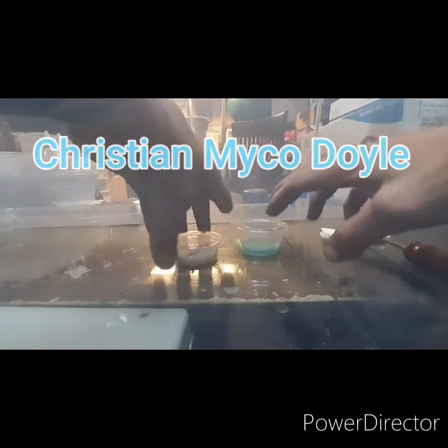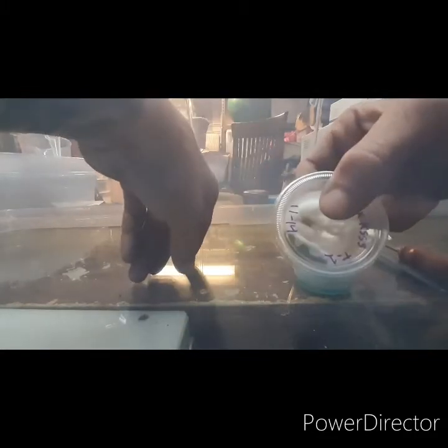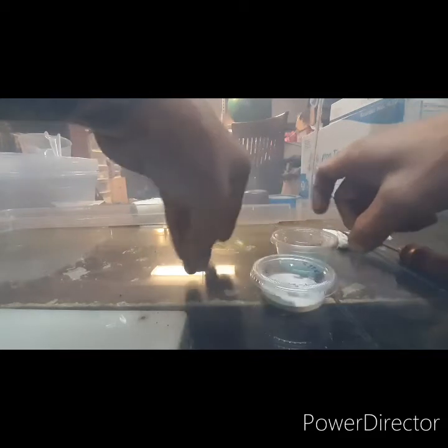For those of you wondering how my agar punches work — these are pretty much just garbage. This one never made anything and this one obviously has some contamination in the corner, so I'm just going to use these as quick little examples on how you use the agar punch.